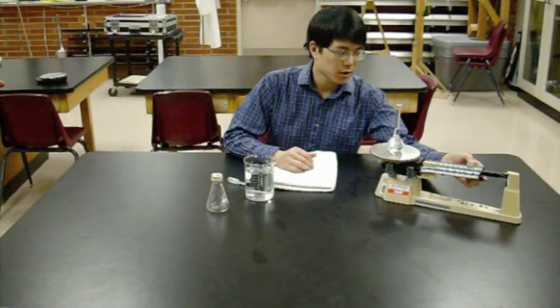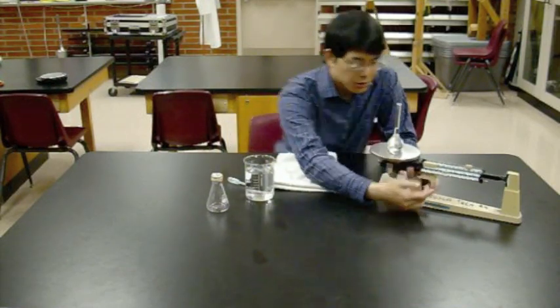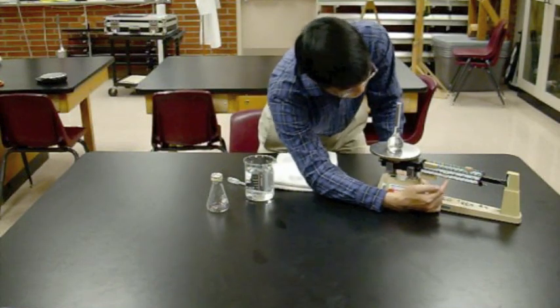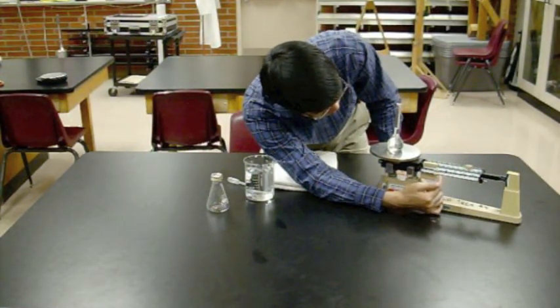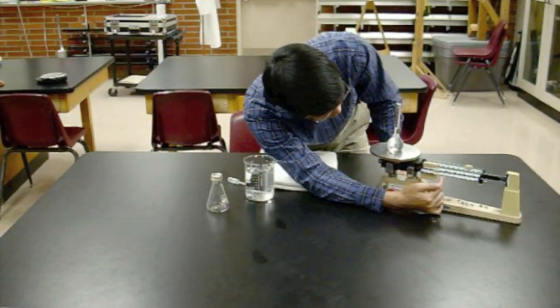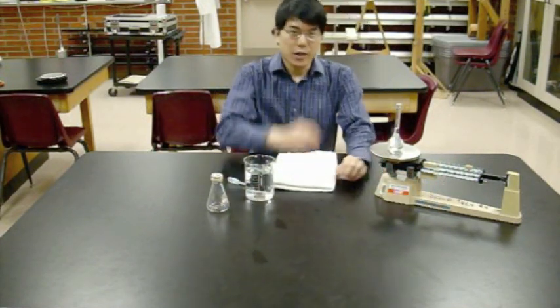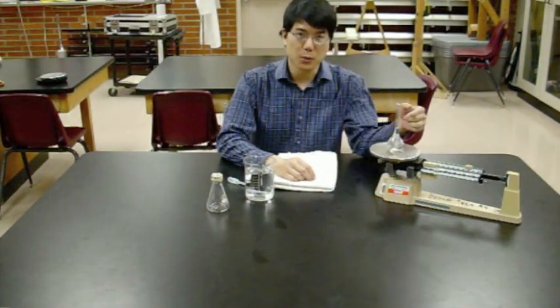It tips the scale right there. Back off one. And then use the lightest slider until you get it balanced. There we go. So that's your mass measurement for the volumetric flask with the water in it.